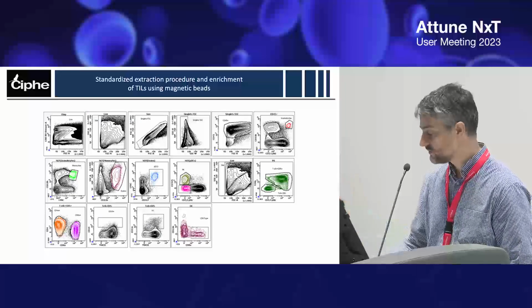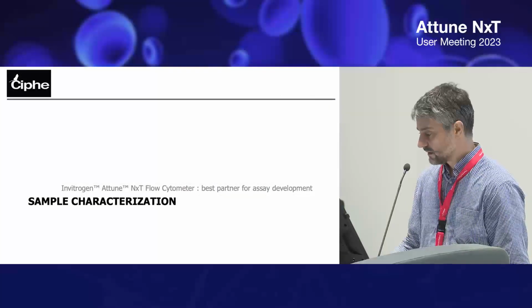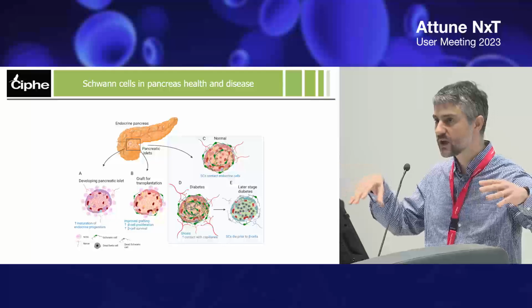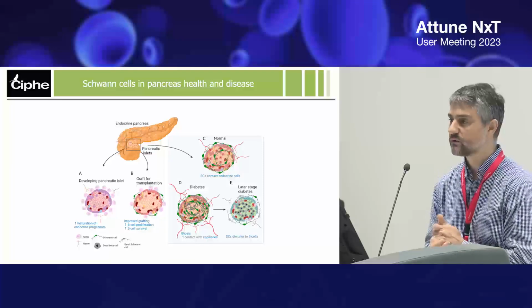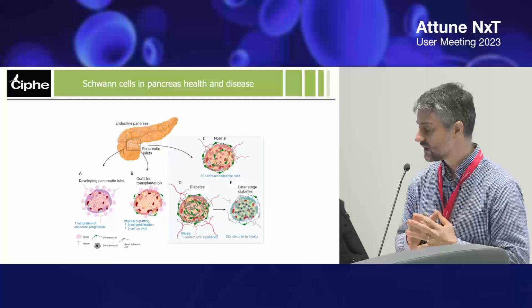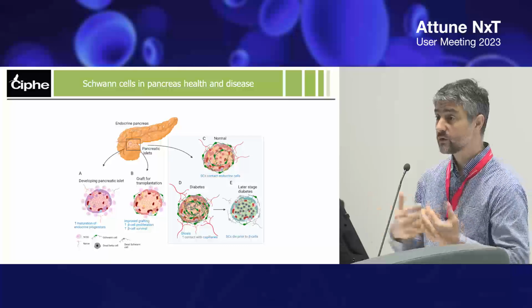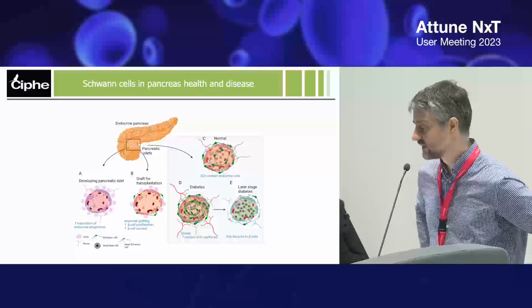And obviously after that you can immunophenotype, use different panels, and capture different types of populations. So all that is one thing, but then the problem starts. We are very secure in our field when we look at organs of lymphoid tissues like spleen, lymph node, bone marrow, thymus. This is very easy. Then it starts to be complicated when you want to address immune cells in, for example, the liver, the brain, or the pancreas. And then we move out of our comfort zone. I would say the next one would be the tumor, obviously, and PDX.